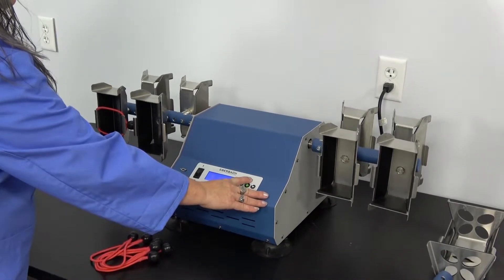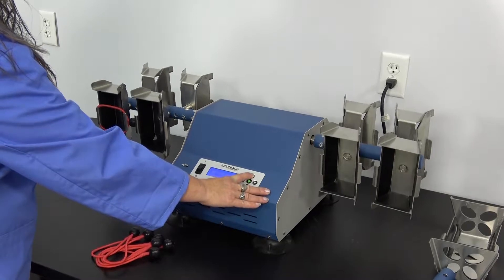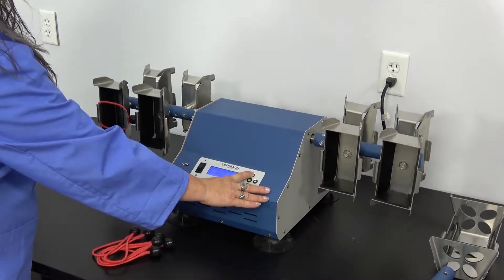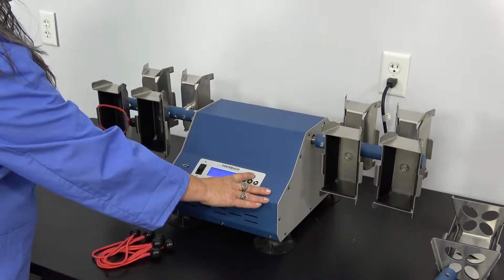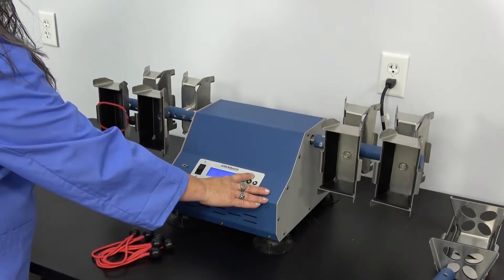It can be easily ramped up by hitting the up arrow all the way up to the maximum of 960 oscillations per minute.